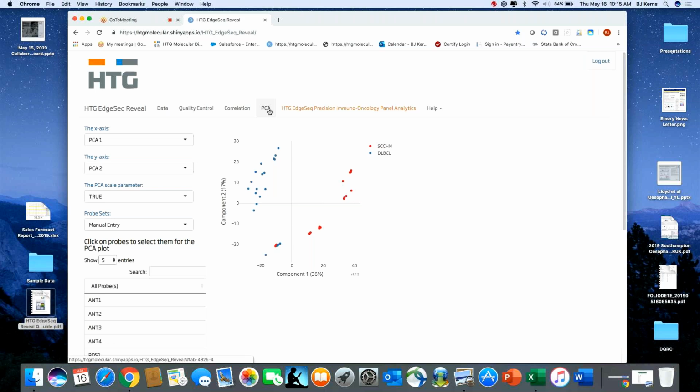That's not to say that if you have pre and post tumors, or stage 1 and stage 2 tumors, and those dots are sitting right on top of each other, you won't see statistical significance on some genes. It's just saying those populations are not that different from each other.